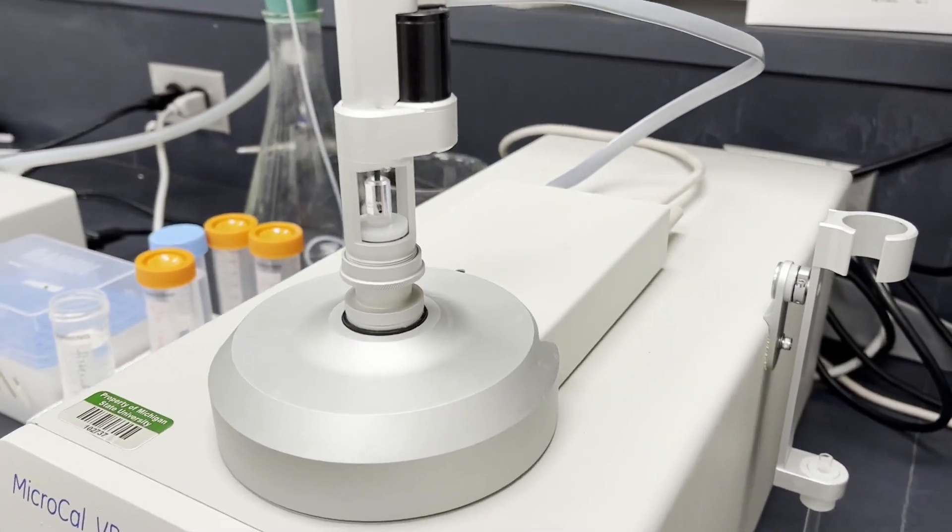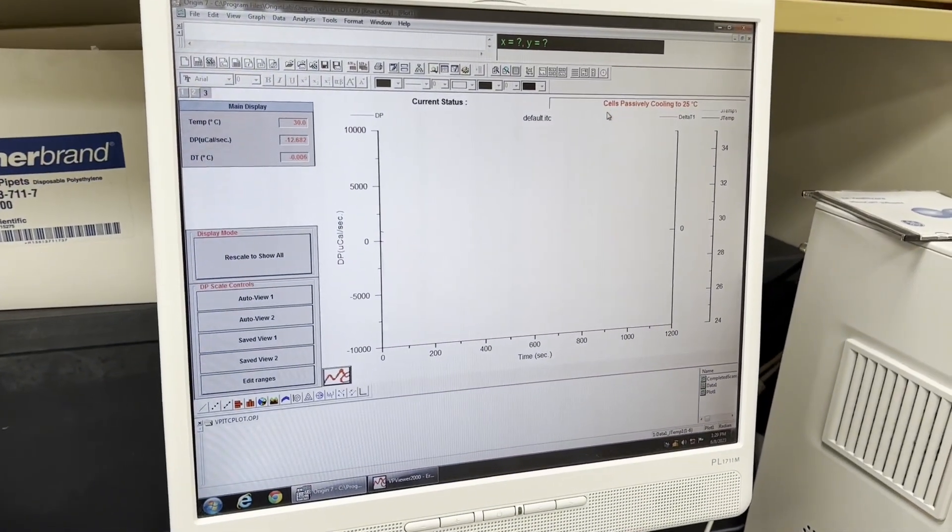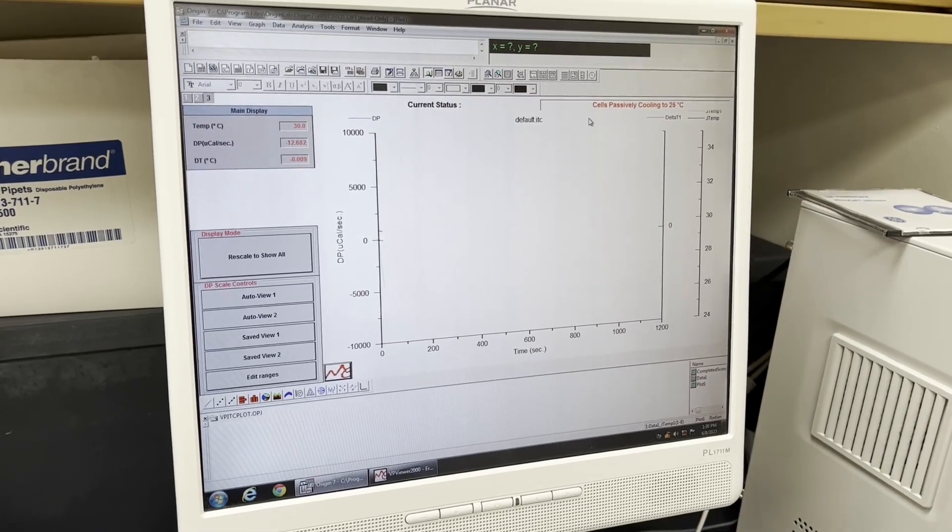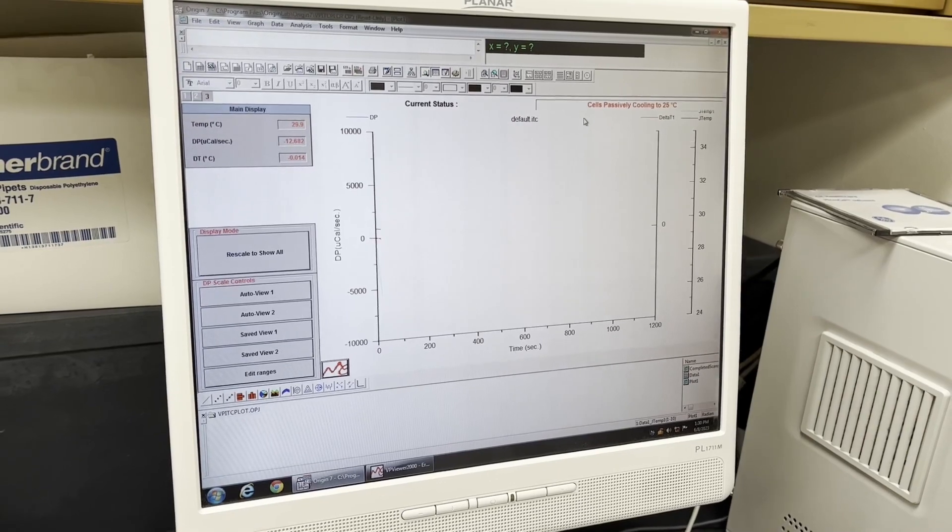Then it's really boring for a really long time because it will go through a whole equilibration process to make sure it's the exact temperature that you set it at and the baseline does not drift significantly.